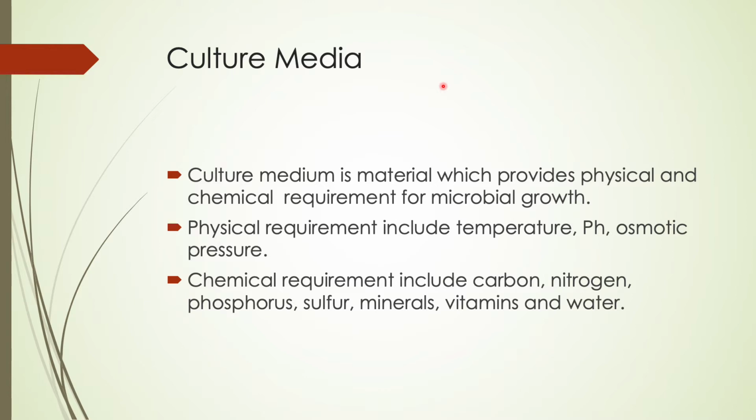And the third thing is that by the early 19th century, many media were available to aid in diagnostic activities. For example, activities like testing antibiotics, culturing a specific kind of bacteria, and isolation of some proteins that are extracted from some bacteria, etc.